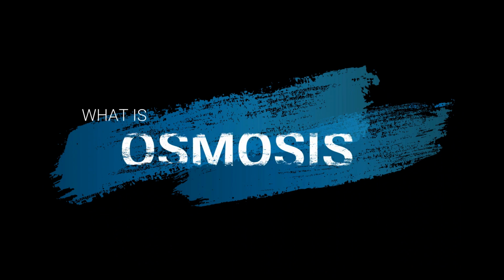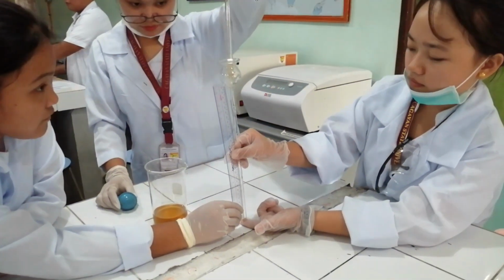Osmosis is considered as the counterpart of diffusion. It is the movement of solvent particles across a region of dilute or lower solute concentration to a saturated or higher solute concentration until the concentration of the two regions reaches equilibrium. Cells use osmosis as a way to maintain its internal environment and react to changes in its external environment. Let us try to simulate osmosis.